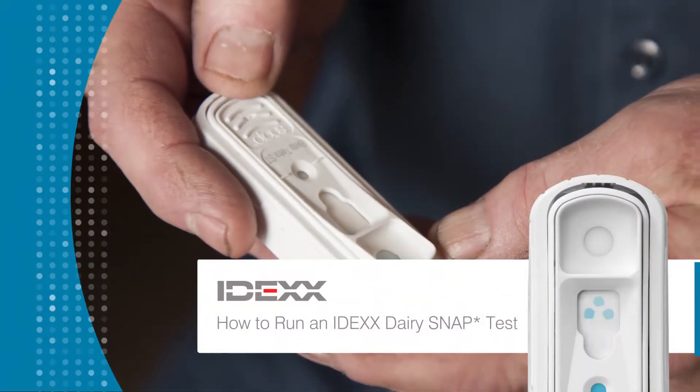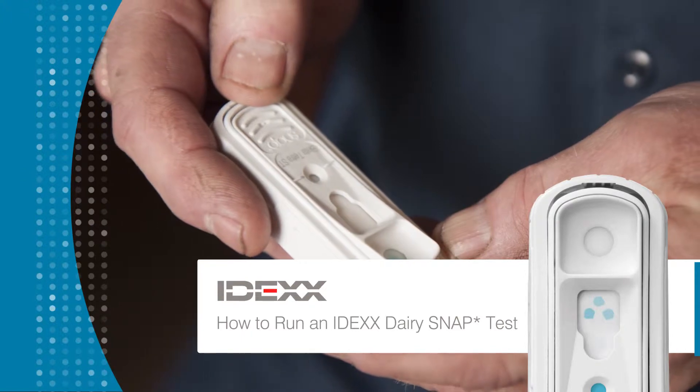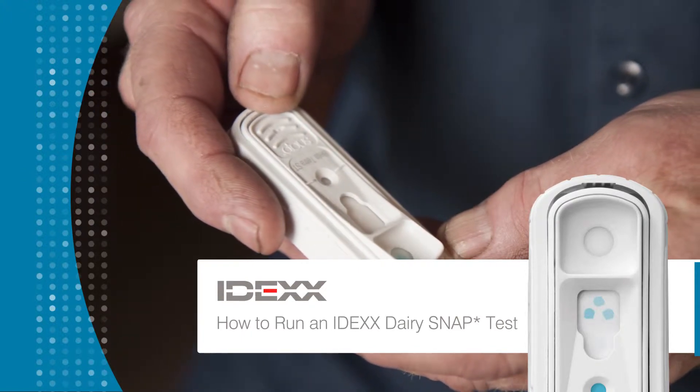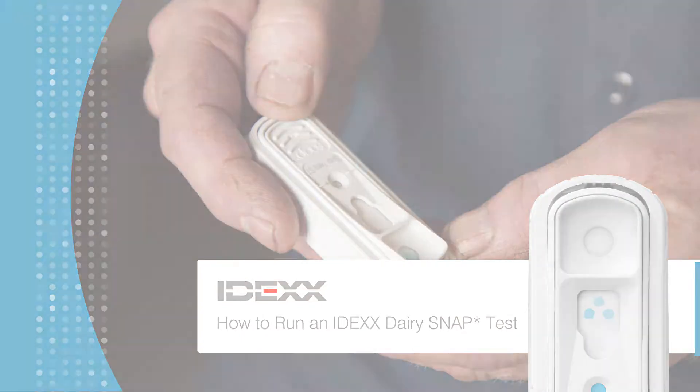In the next two minutes, you'll learn how to detect antibiotic residues with an IDEXX Dairy SNAP test.